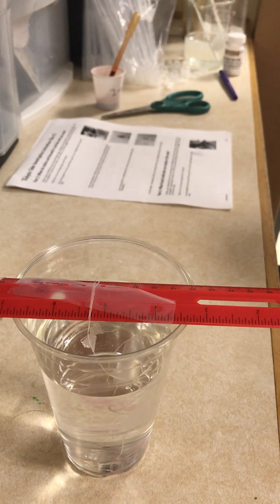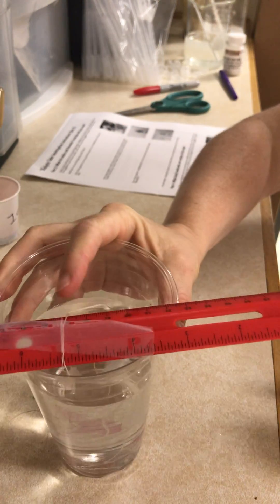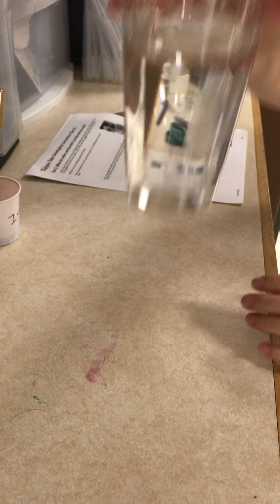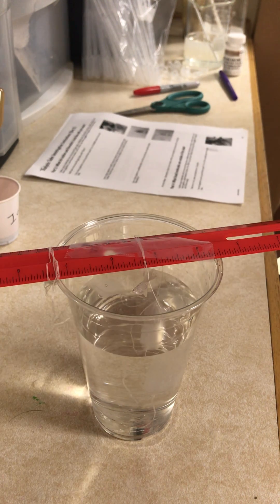We are in metabolic reactions, lesson three. Our dialysis tube system has been sitting overnight and we are going to test first what iodine and Benedict's look like with just water.